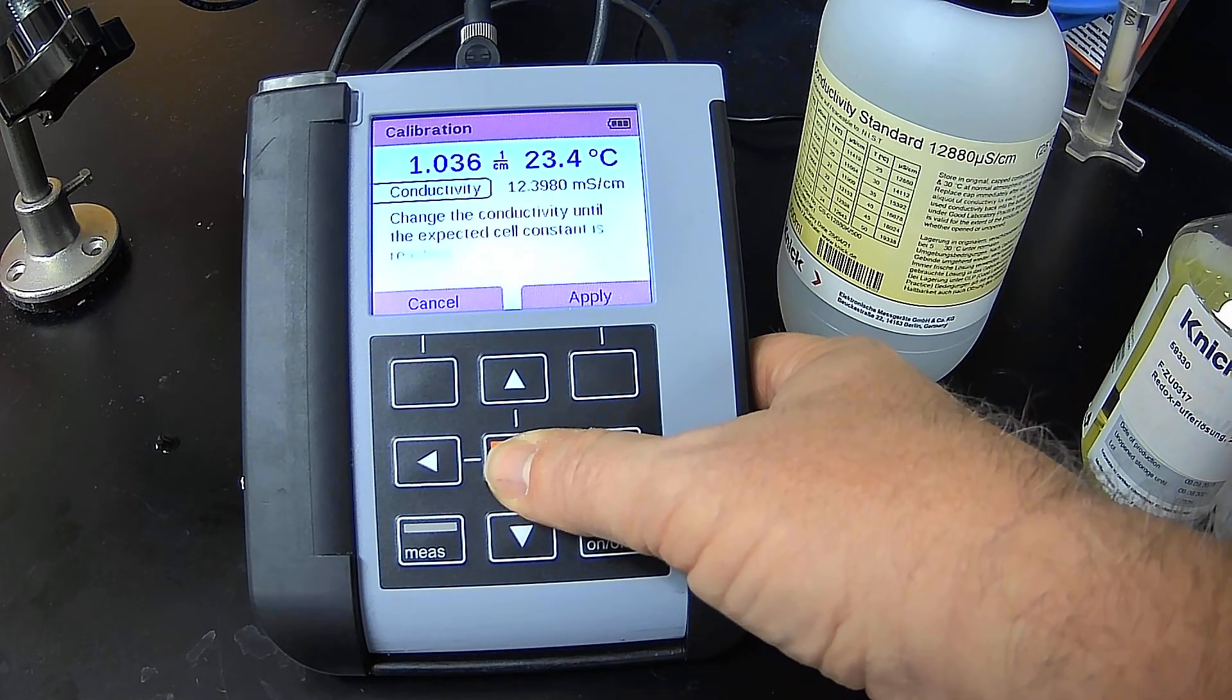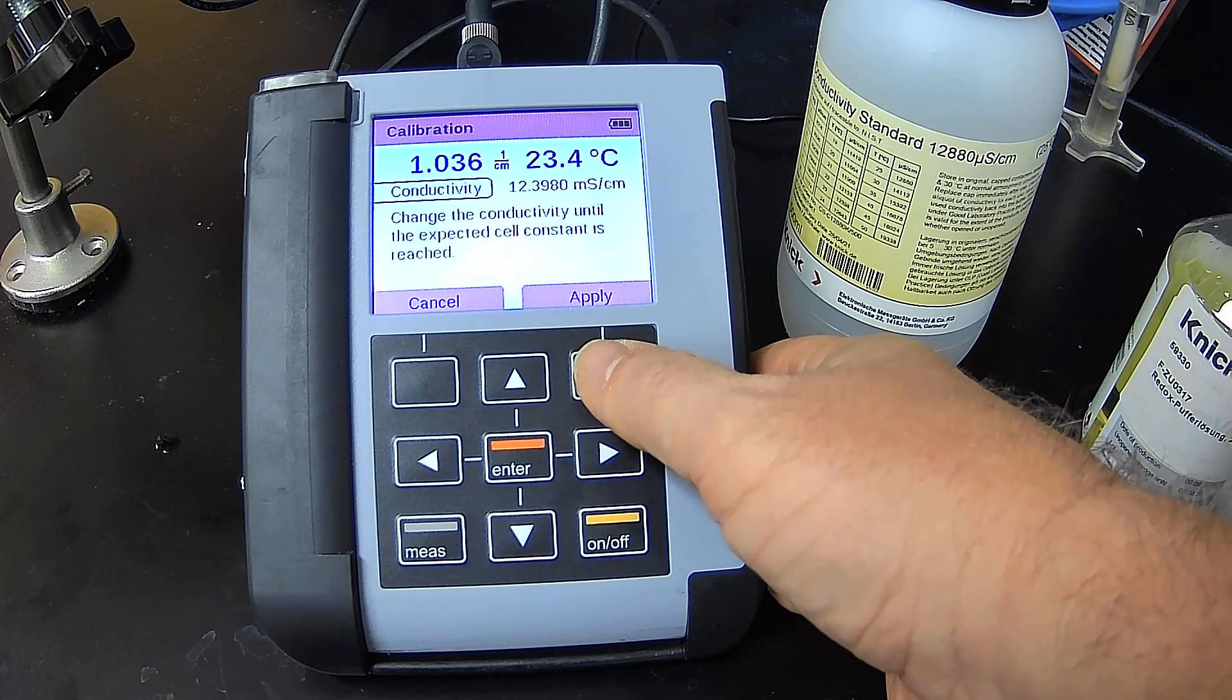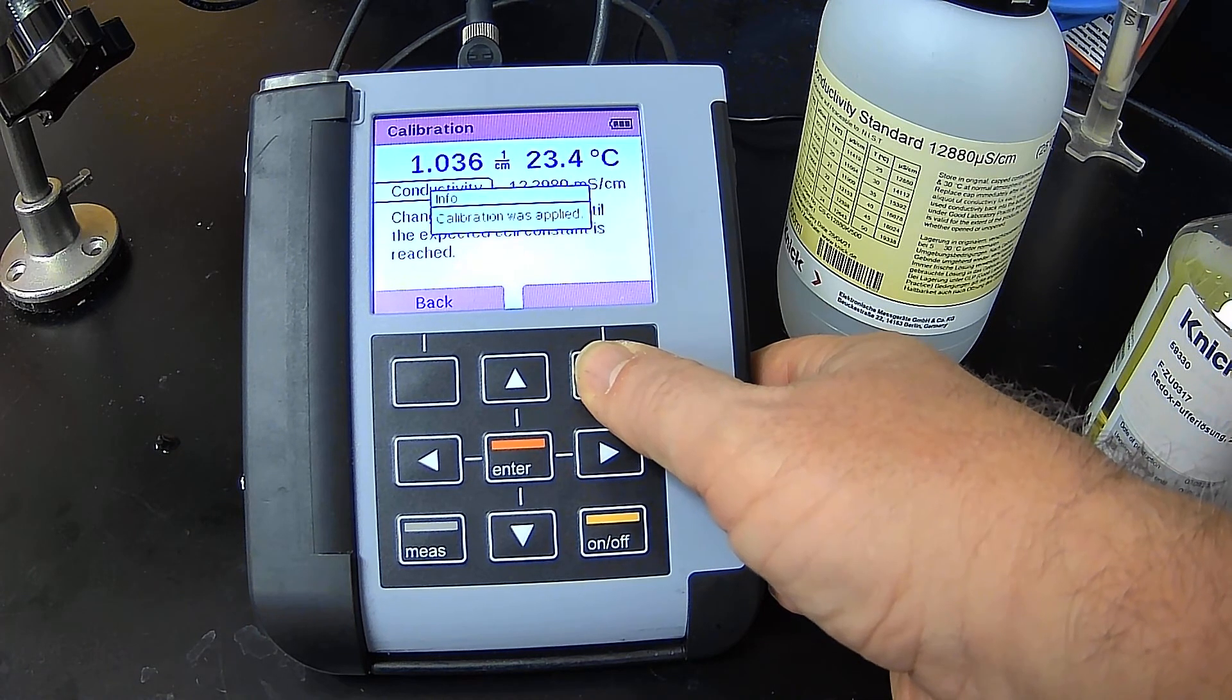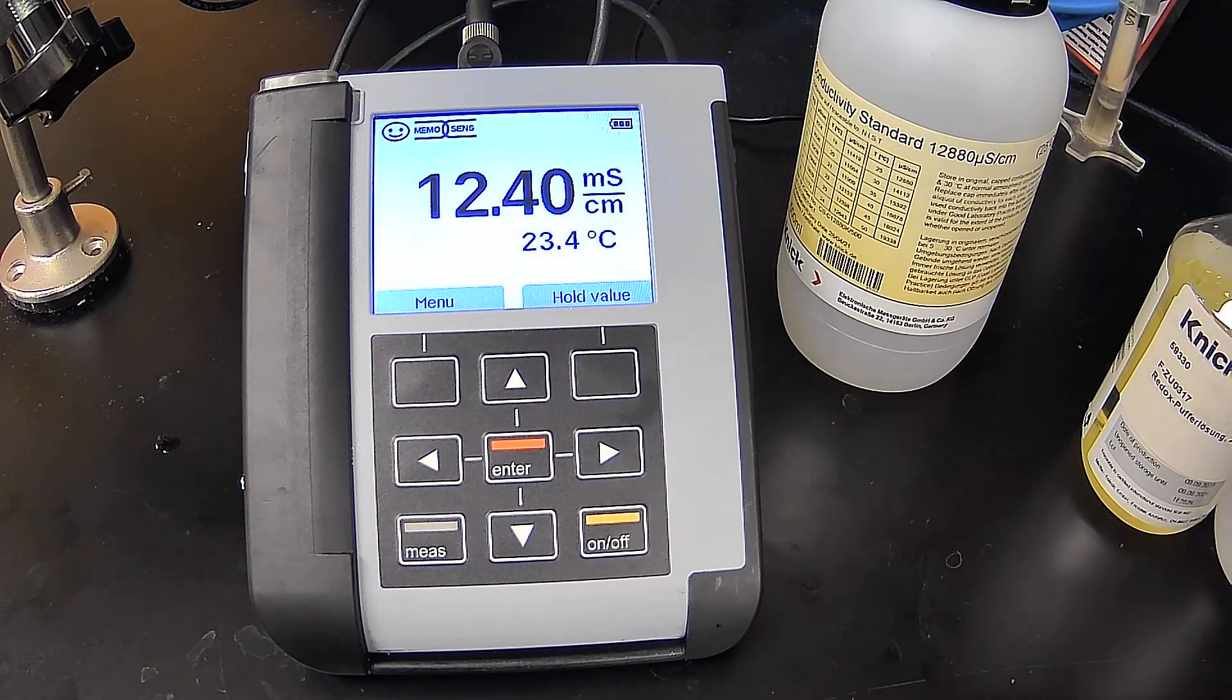We hit enter, then we hit apply. There we go. So 12.4 millisiemens is what the value is.